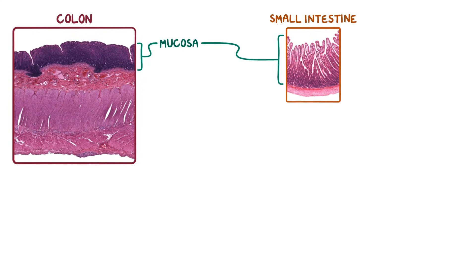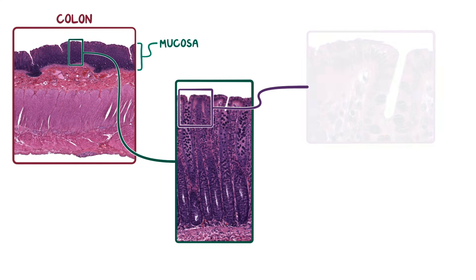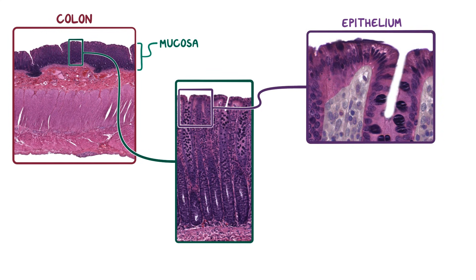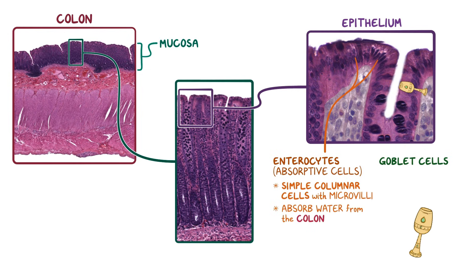Taking a closer look at the colon's mucosa, the lumen of the colon is seen at the top of the image, and the first layer of cells lining the mucosa is the epithelium. The epithelium consists of two types of cells: enterocytes and goblet cells. The enterocytes, or absorptive cells, are the simple columnar cells with microvilli, responsible for absorbing water from the colon lumen. The goblet cells are responsible for secreting mucus, which is easily seen as globular structures stained dark purple from the hematoxylin and eosin stain.